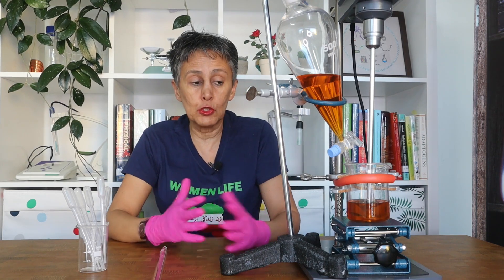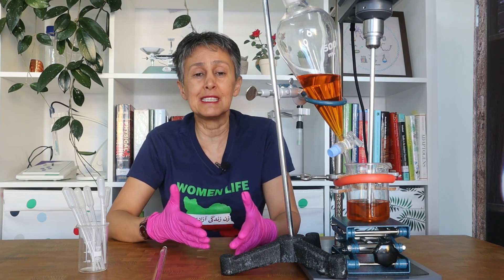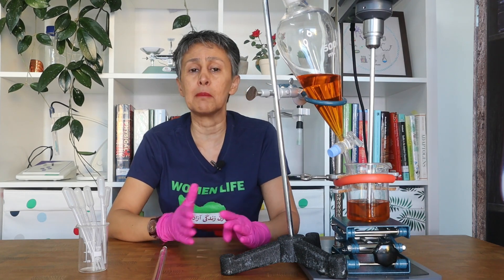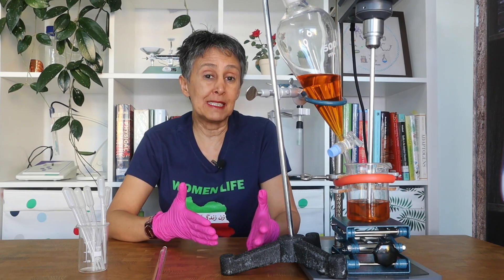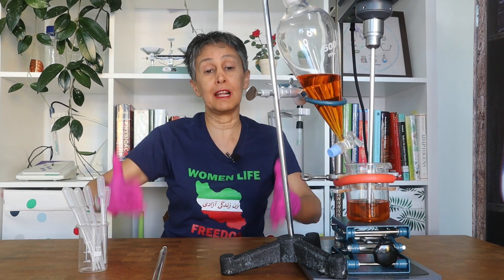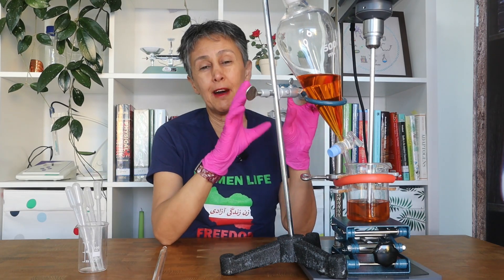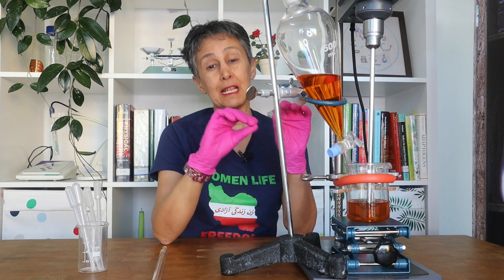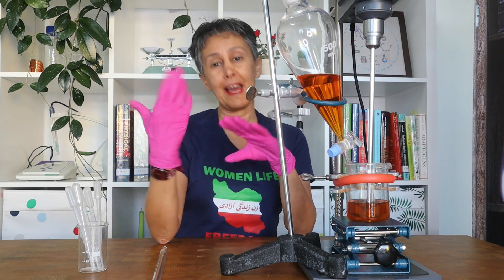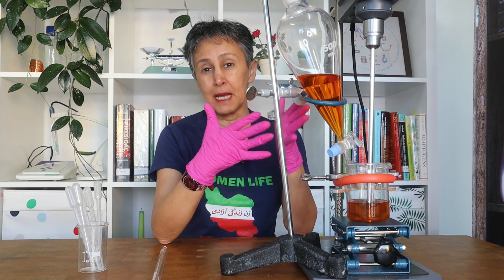You can go and purchase dispensing systems, automated systems, pumping systems — they are all extremely expensive and they take up real estate in your lab. Today I'm going to show you an artisanal way that is much cheaper, less elegant, and less high-tech compared to a piping system, but it works the best.